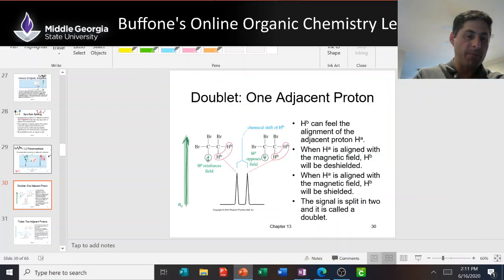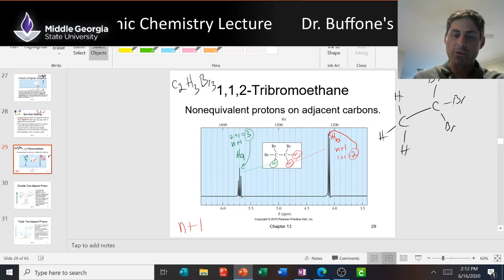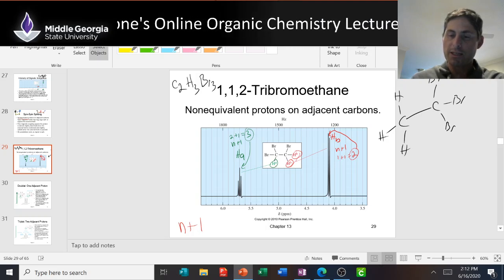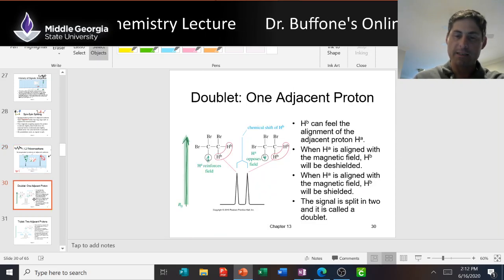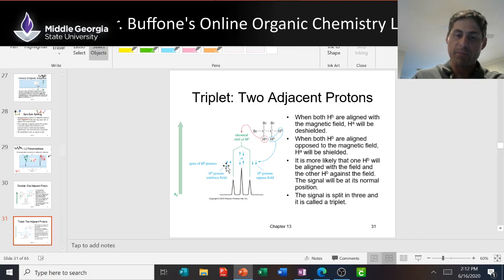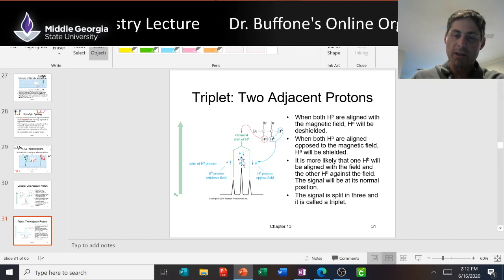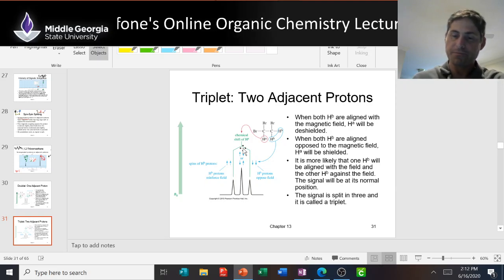And that's what we see in that spectrum. This guy is split into a triplet, 1 to 2 to 1 peak heights. The doublet is, right, these in red are split into a doublet with 1 to 1 peak heights. And then this is that same explanation that I gave for the doublets and triplets. Both spins up, both spins down, or reinforcing the external magnetic field, opposing, one reinforcing, one opposing, but you have two options here for that.